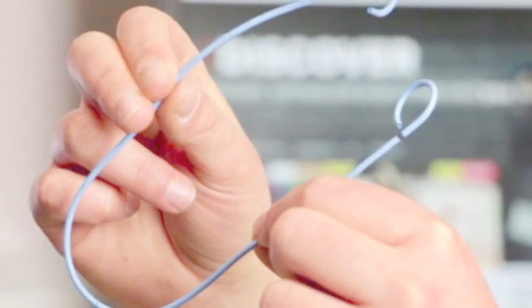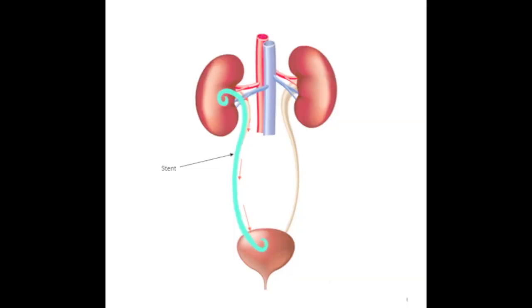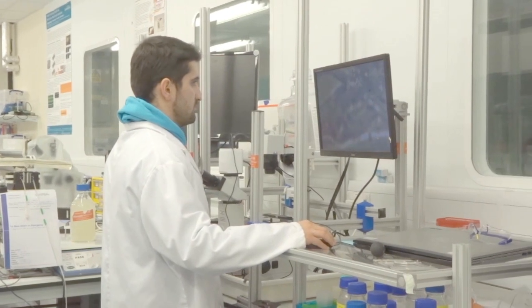As a critical component in the treatment of all of these, a stent is used in the urinary system to allow the bypass of the urine from the obstructions and ease the urine drainage. However, more than half of these stents fail due to crystallization and biofilm formation, which costs a lot of money for healthcare providers and has a negative impact on patient quality of life. I have used microfluidic technology and lab on a chip to design a platform that has allowed me to understand the mechanism of these failures and introduce new designs to resolve these issues.